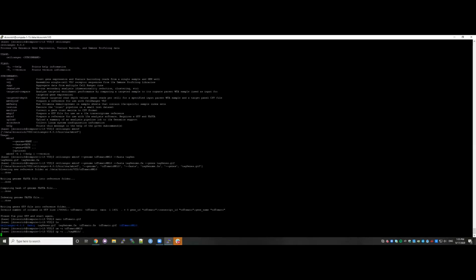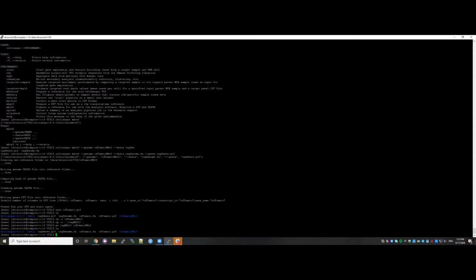Okay, just wait a second. Okay, so now I'm going to move this tag mm10 to td tomato mm10, and we are good to go.